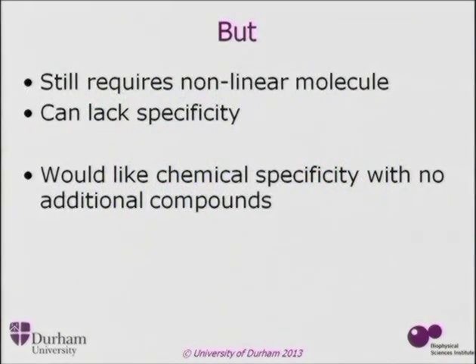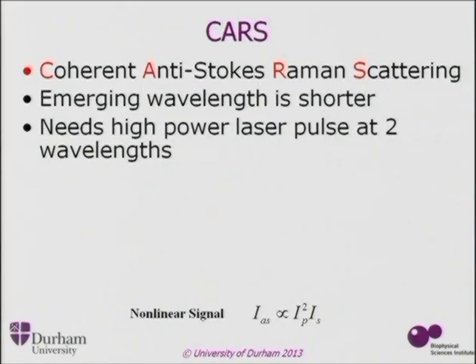But we still need a molecule in there that's got certain properties. So can we get away without having that? What we would like is something that's chemically specific, but where we haven't had to add anything extra to it. And so the technique that was developed initially by Sunney Xie at Harvard is CARS, Coherent Anti-Stokes Raman Scattering.